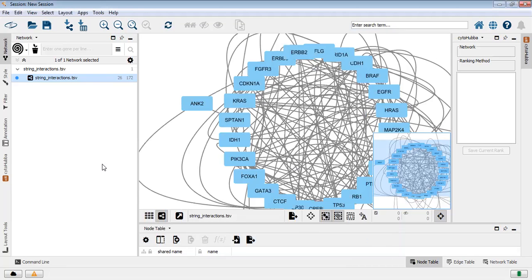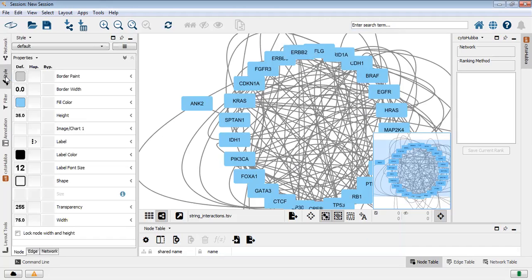So we will move towards the network part. So this is the network. Now this is only the network thing. Now you can even change your network based on your interest.